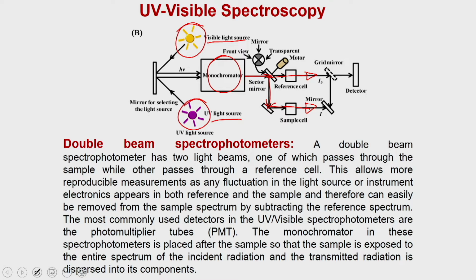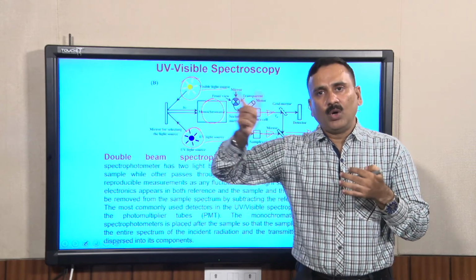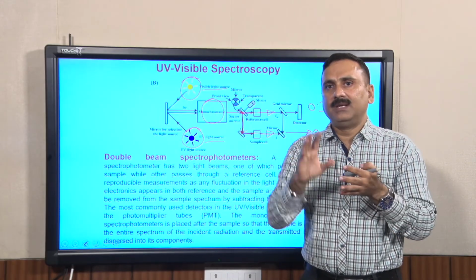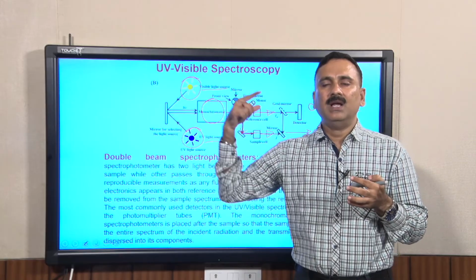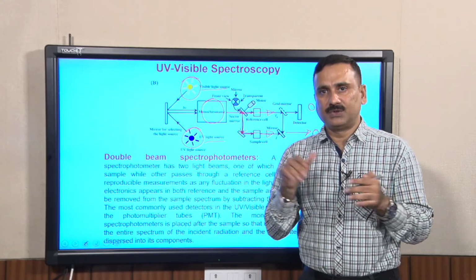Now the problem that the reference sample is not available to correct the test sample's absorbance is not there. If in the beginning the reference is 0.3 and later on it becomes 0.2, then the sample also, if initially it was 0.4, becomes 0.3. Because it is measuring both in real time, it can do the correction on its own. With the help of the software you can ask it to keep subtracting the reference cuvette from my test sample and keep giving me the values.